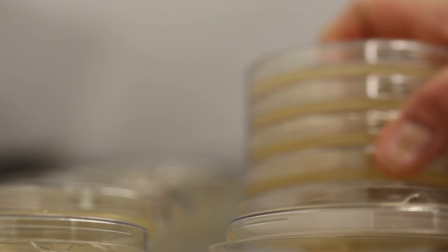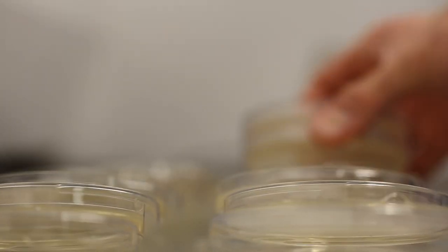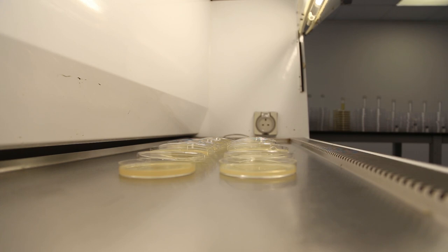A normal method of drying plates is by using a laminar flow cabinet where clean air is passed over the agar surface to evaporate any moisture present.